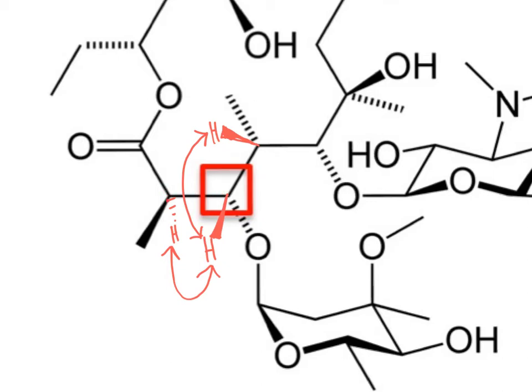So we're looking at the adjacent carbon atom and what protons are directly bonded there. Generally, if we're looking at this proton and we see a heteroatom, there will not be coupling through to the next atom there. So if you look and you see that there is an oxygen going this direction, don't expect any coupling to continue on past that oxygen. So if there were an OH group here, for example, there would not be coupling generally between that and the proton that we see here. And likewise, if we come on down, we're getting too far away to get coupling down to here. So the extent of the expected COSY correlations are what I've highlighted here in red.